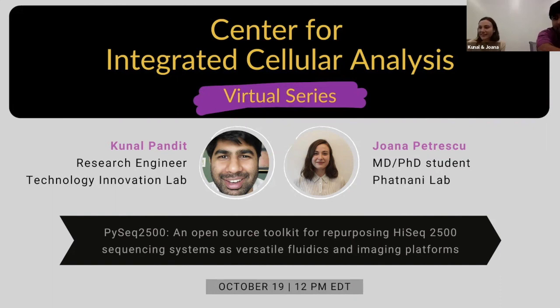Yeah, that's a great question. We haven't done it yet, but one of the groups that we're working with is interested in doing this, and we have a number of thoughts about how that could be done by either growing the cells directly on the cover glass, or maybe even seeding them into the flow cell that we have designed, but we haven't directly tested it yet.